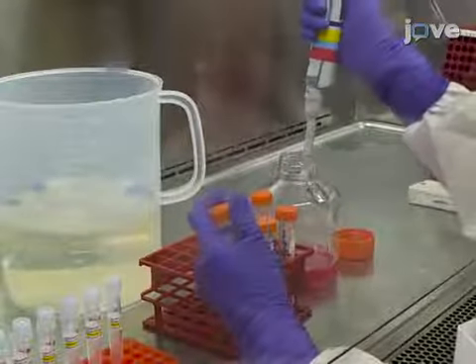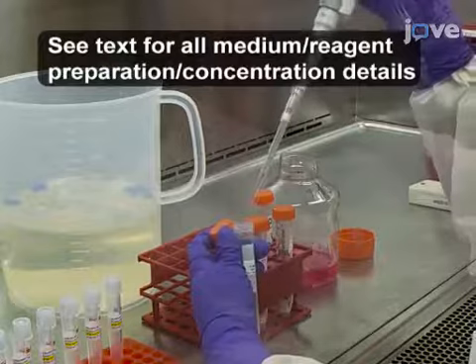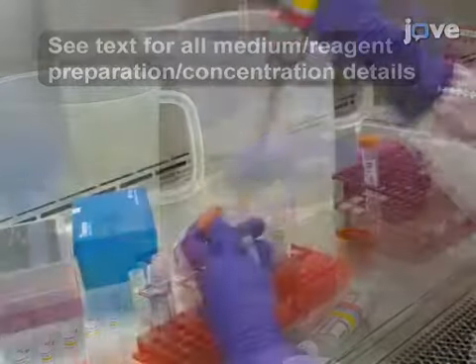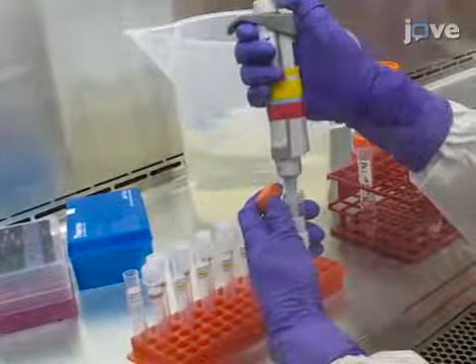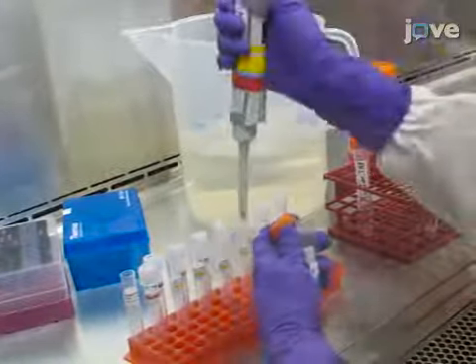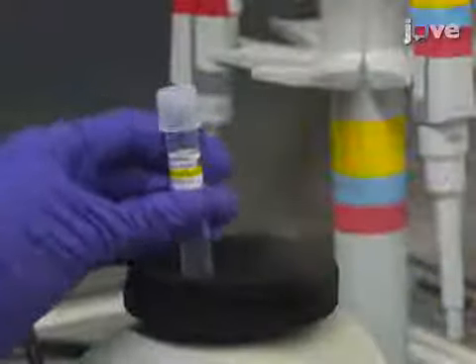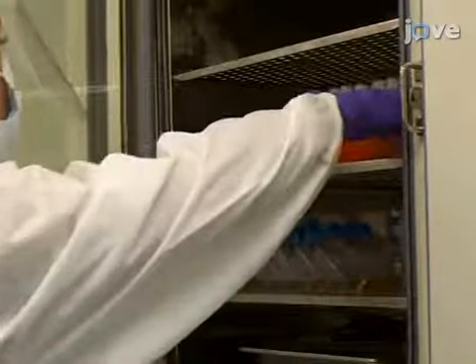Begin by resuspending the Rhesus PBMC in R10 medium at a 1.6 times 10 to the 7th cells per milliliter concentration. Aliquot 50 microliters of cells to the appropriate number of flow cytometry tubes, and add 50 microliters of protein kinase inhibitor to each tube. Vortex each tube and incubate the samples at 37 degrees Celsius for 30 minutes.